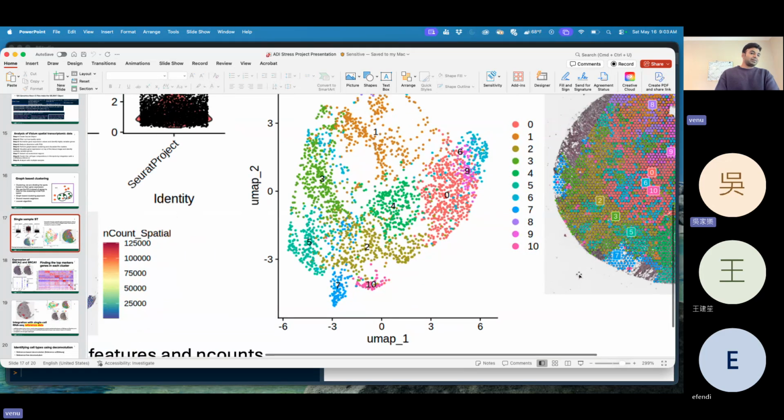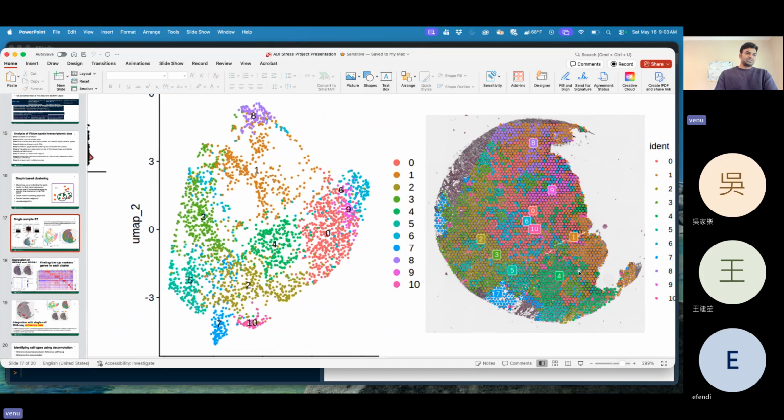So this is a cluster. They assign it as a single group of cluster. All these spots are here, like a group of single cells over there, but here it is a group of similar spots, similarly expressed spots, at spot level. Here 4 is transformed to here, and 3 is here. The UMAP will show us the arrangement of these clusters based on top markers and top genes. That is the reason we observe a clear pattern.